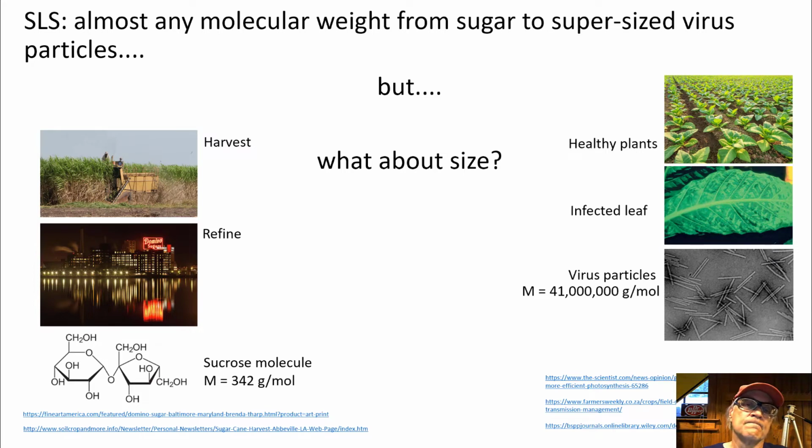Well, hello. This will be our fourth video on static and dynamic light scattering, but finally we're going to focus a little bit on the dynamic light scattering. And in order to do that, I should tell you about why it is so important.